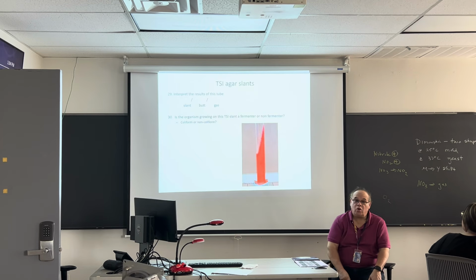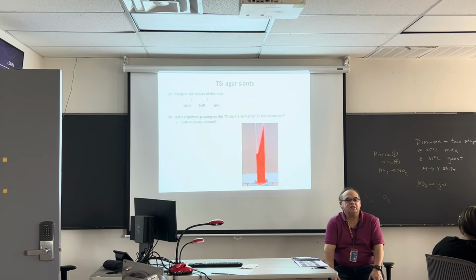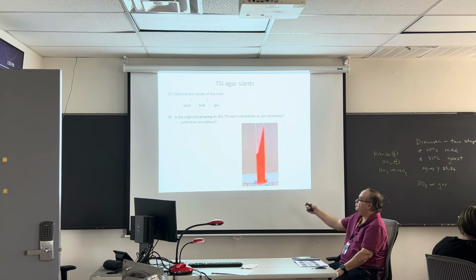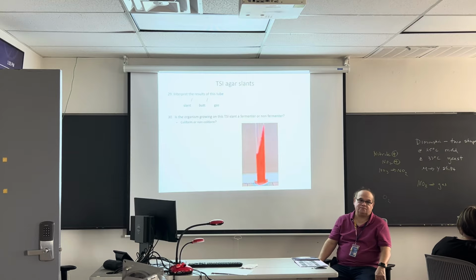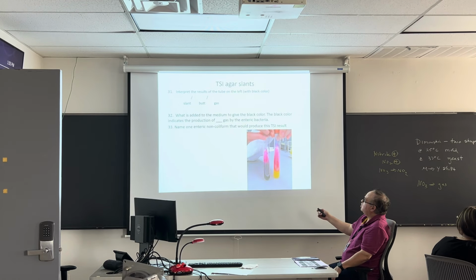Remember, this is a timed test this time. You won't be able to go back at the end. You have to ask the clarification questions during the time we're taking the test. We will not be going back. Yes, Malika? So is it K no gas? K and no gas. You have to listen to me because I'm going to describe it. It's really hard to see, but there is a difference here.